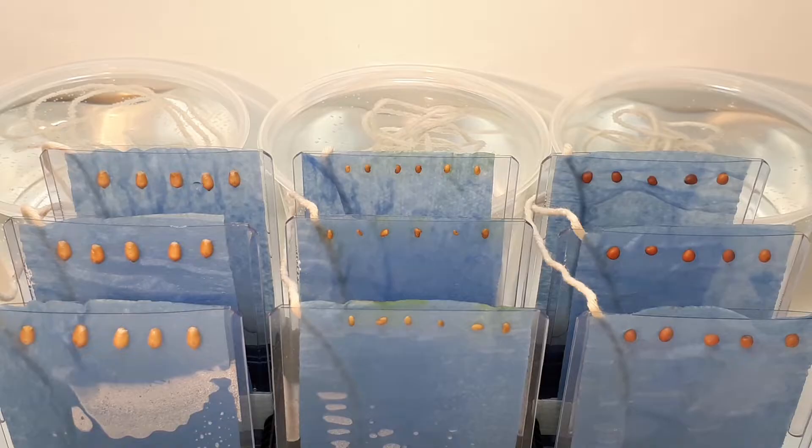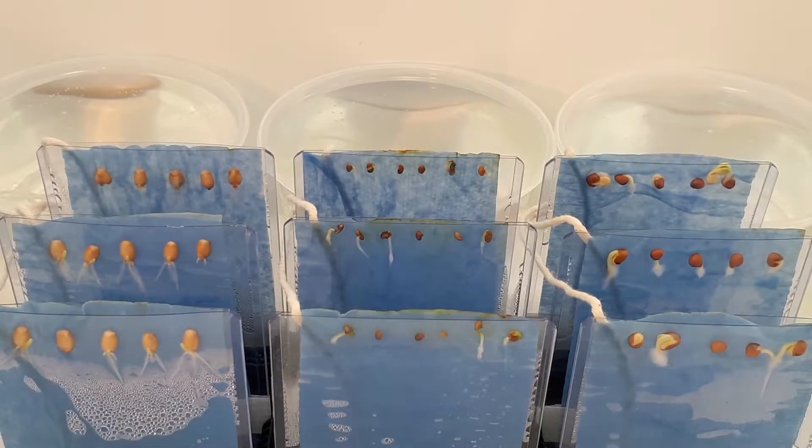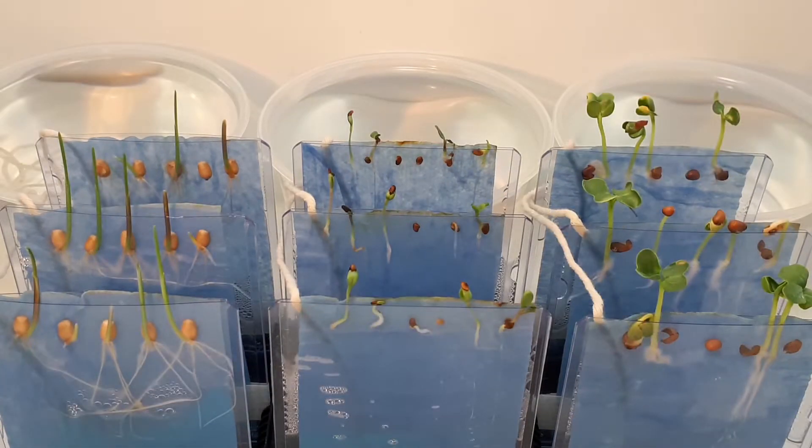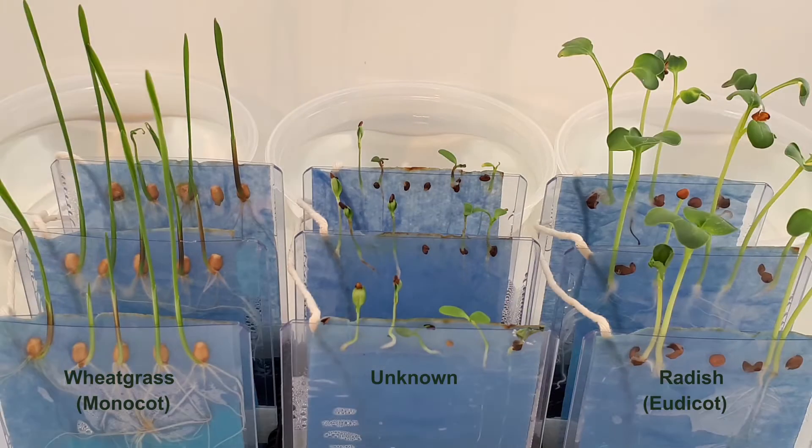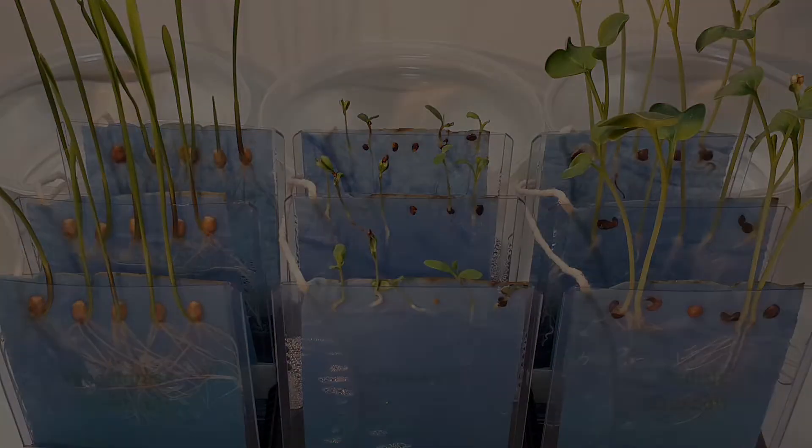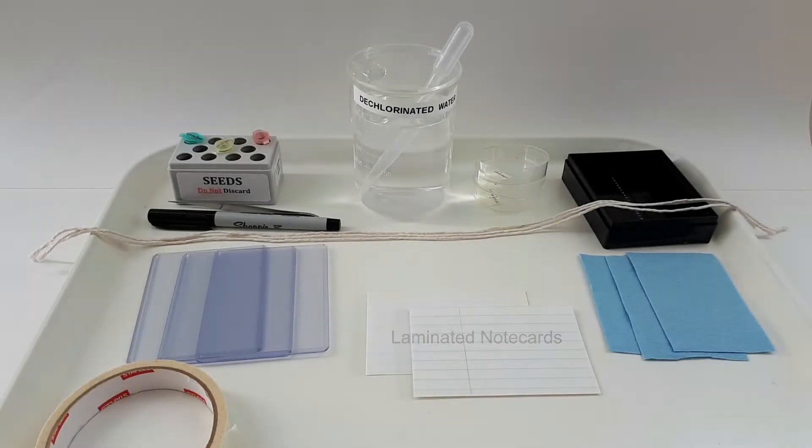In this lab, you will set up plant pockets growing three different types of seeds: a monocot, a eudicot, and an unknown. To make each plant pocket, you will need two pieces of laminated note card, a rigid plastic card holder, a piece of shop towel, and a piece of cotton string.